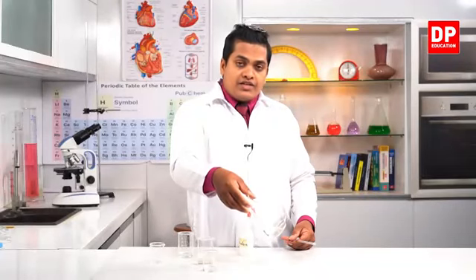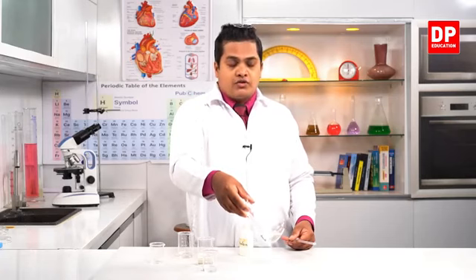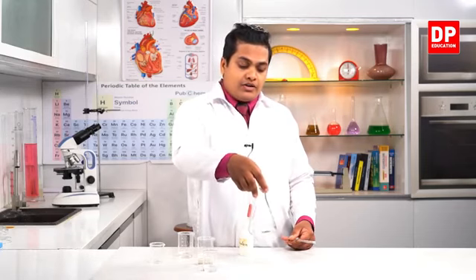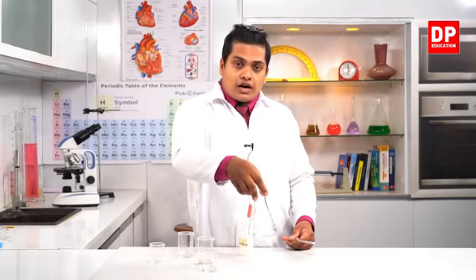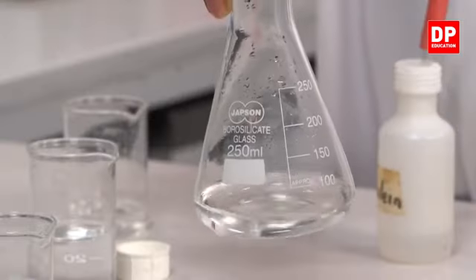That's why there is no pink color. Initially it had pink color because it contains sodium hydroxide solution. So when I add hydrochloric acid into the sodium hydroxide solution, gradually the pink color decreased and it became a colorless solution, right? Now it has converted into a colorless solution.